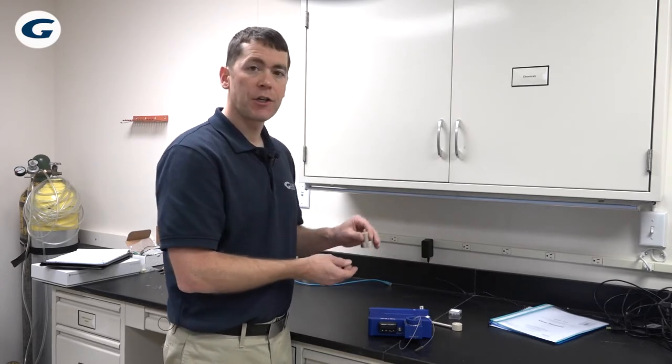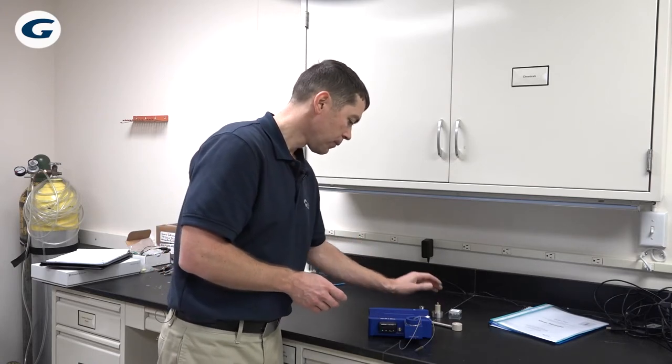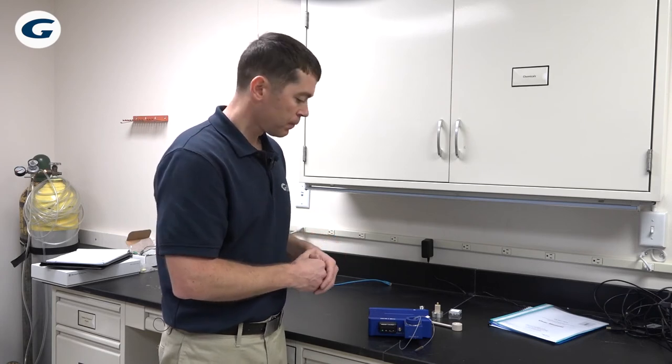There's also a calibration kit that you could use to calibrate your QCM if you wanted to. This uses the standard 5 megahertz crystals, 14 millimeter diameter crystals. A variety of metallizations and coatings are available.